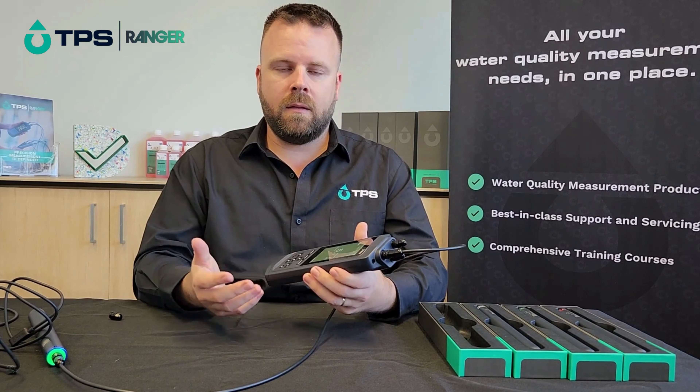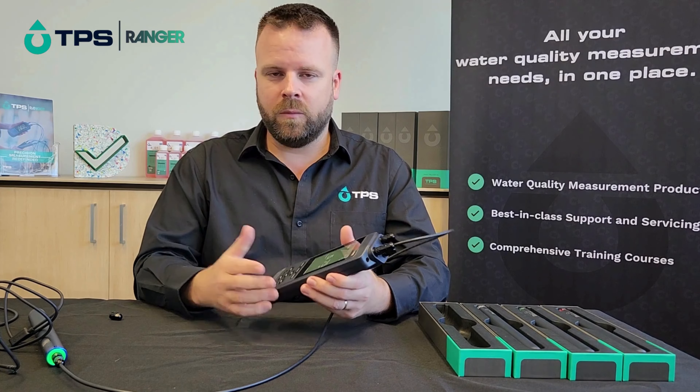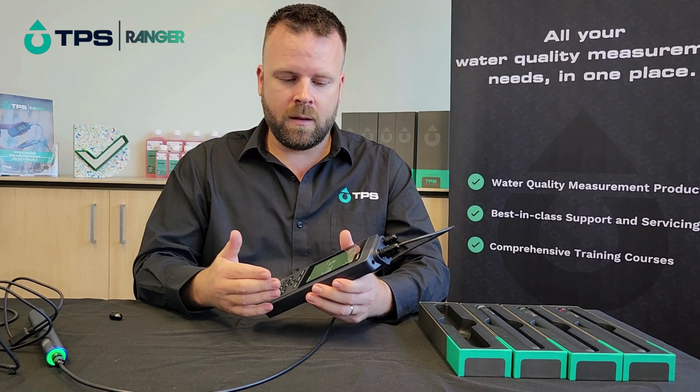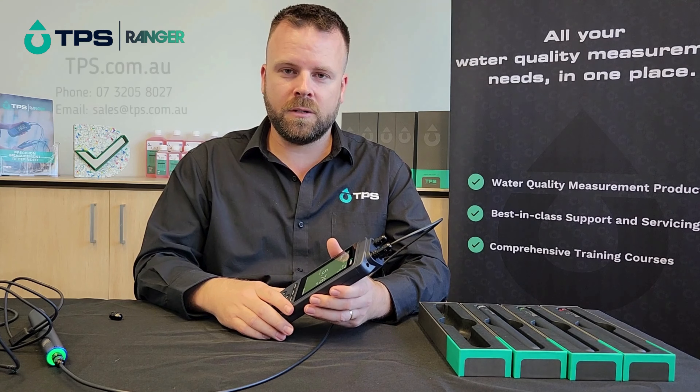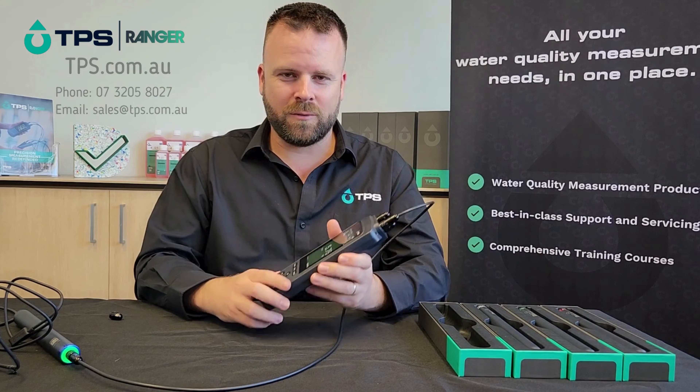We all love dark mode here at TPS — we think it's actually pretty cool. If you have any questions or need any help getting set up, or have questions about the sensors, by all means get in touch and give us a call. Thanks for purchasing with TPS — I hope you enjoy many happy years of water quality testing with the TPS Ranger.